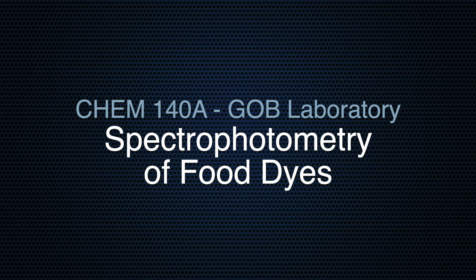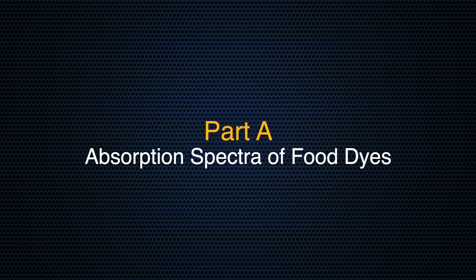Welcome to the GOB laboratory at Mercy University. In this experiment, we'll investigate how visible light interacts with colored dyes and how we can use that information to analyze the colorings present in sports drinks. In part A of this experiment, we'll collect and analyze the visible absorption spectra of six food dyes.